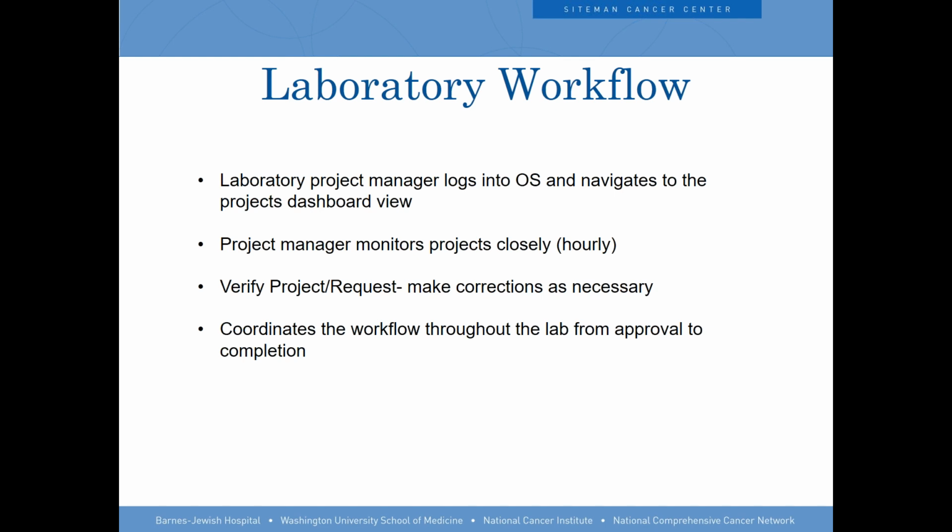We started talking about the development in 2019, and it looks like we finished around September, October of 2019. The laboratory was going through their workflow adjustments and testing it. We went live in January of 2020.